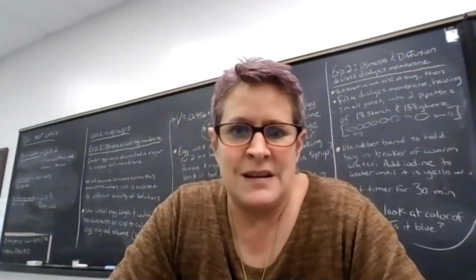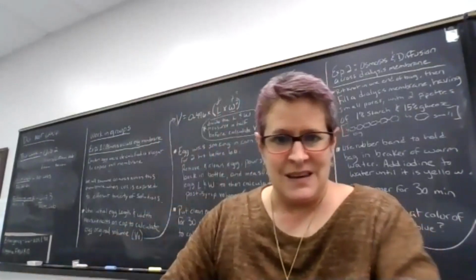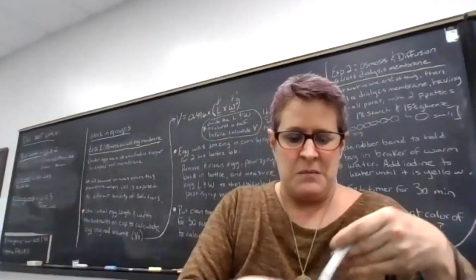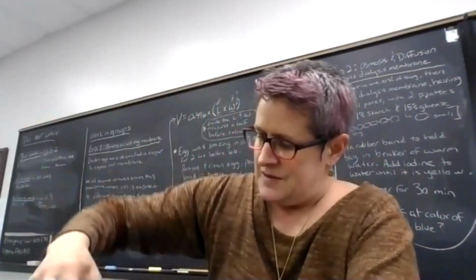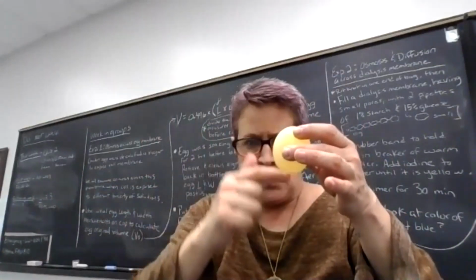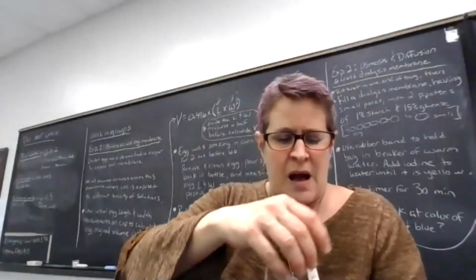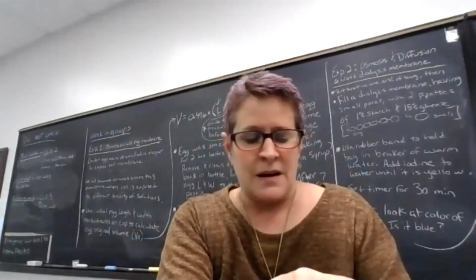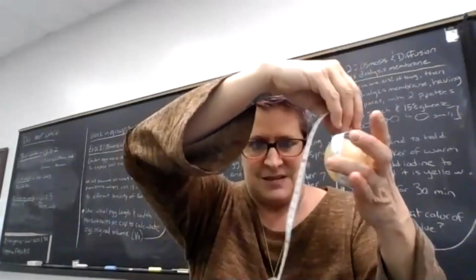Now, how do you find an egg's length and width? Well, it's quite simple. Let's take an egg here, and let's take a tape measure that measures in centimeters. You measure the length from top to bottom, from pole to pole, North Pole to South Pole, if you want to think of it that way. Gently I wrap that tape measure around it, and I got 16.5 centimeters in length. Just like that.